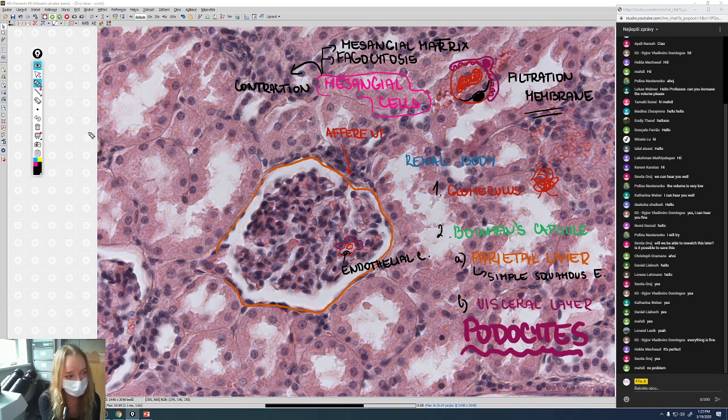And how are we going to find them? These cells don't have contact with capillaries, and they are very eosinophilic. Like all macrophages are eosinophilic, so these cells are eosinophilic too. This is why they are pink right here.